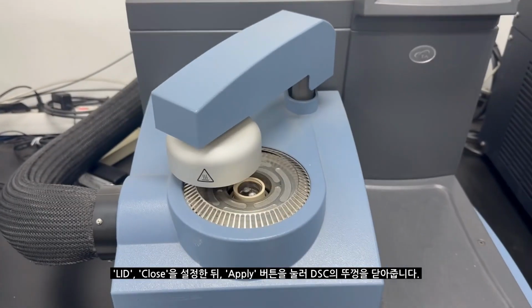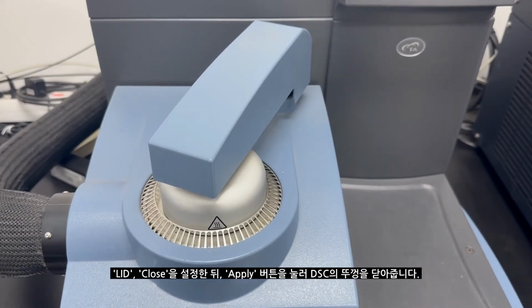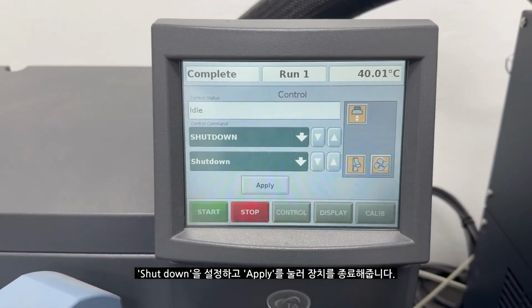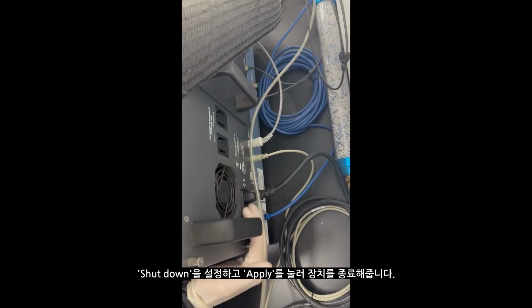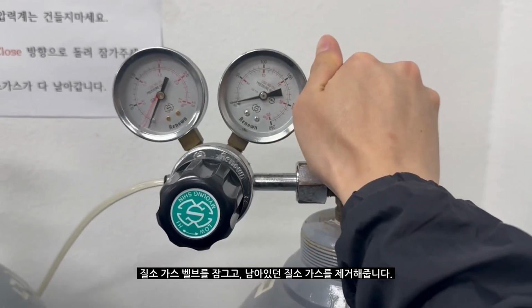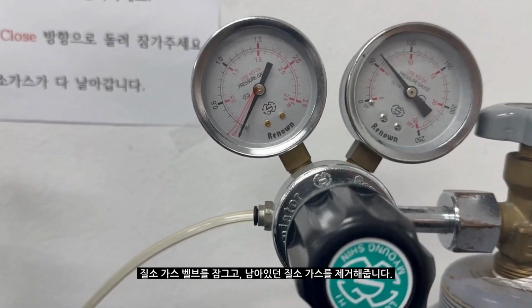Set lid, close, press apply button to close the DSC's lid. Set shutdown, and press apply button to turn off the device. Close the nitrogen gas valve, and remove the remaining nitrogen gas.